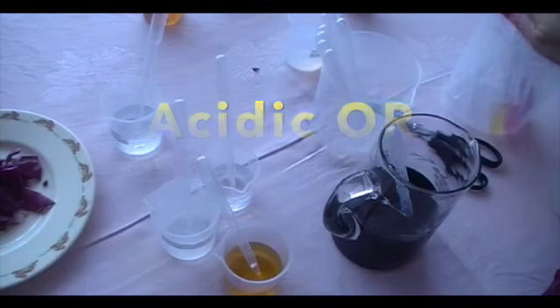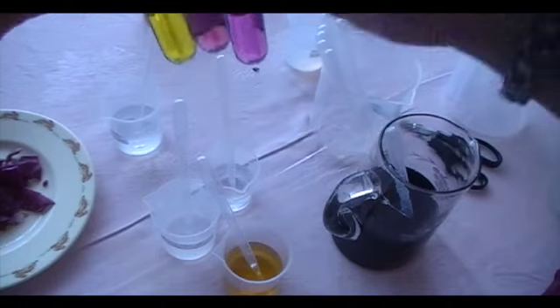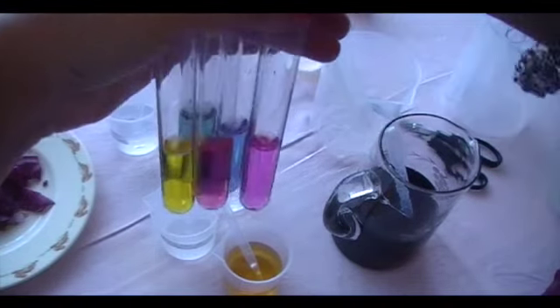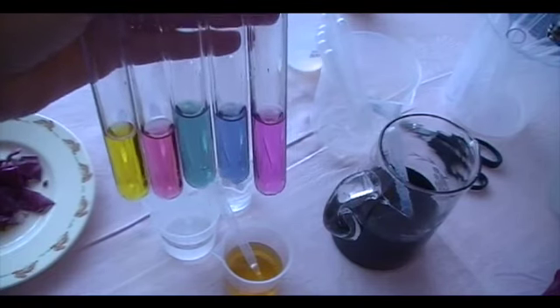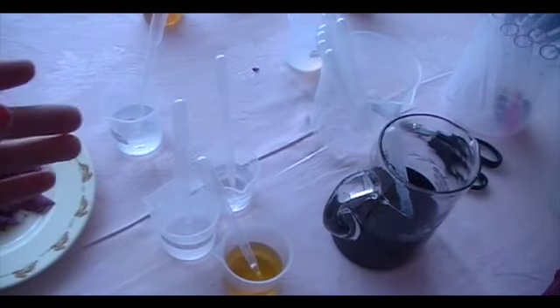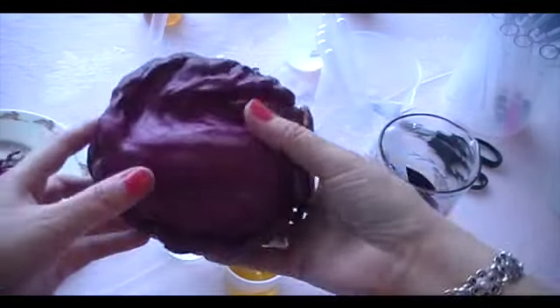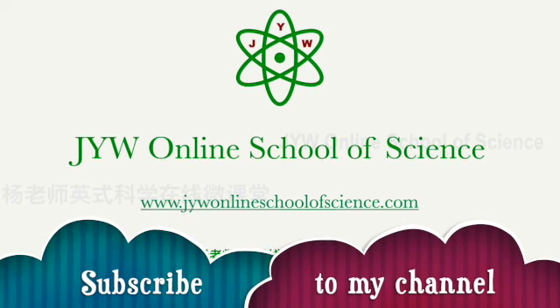So those are beautiful colors. Let me show you again. Beautiful colors of different solutions. Alright, so that's using red cabbage to make your indicator.